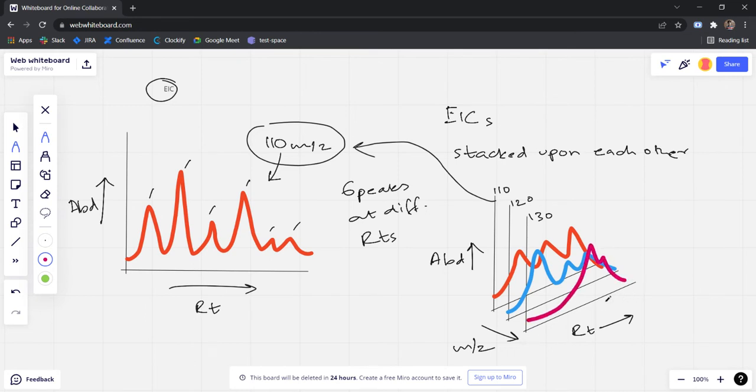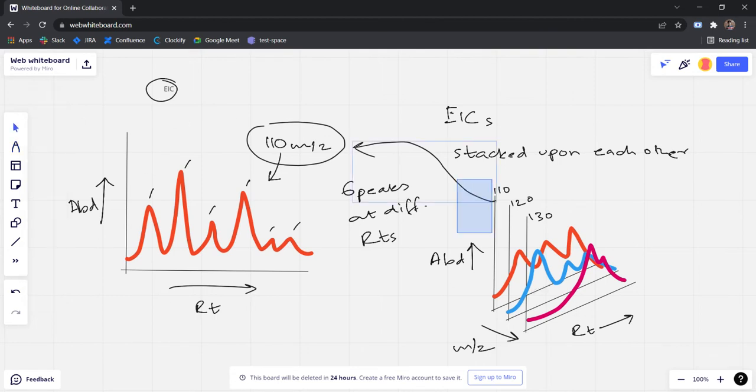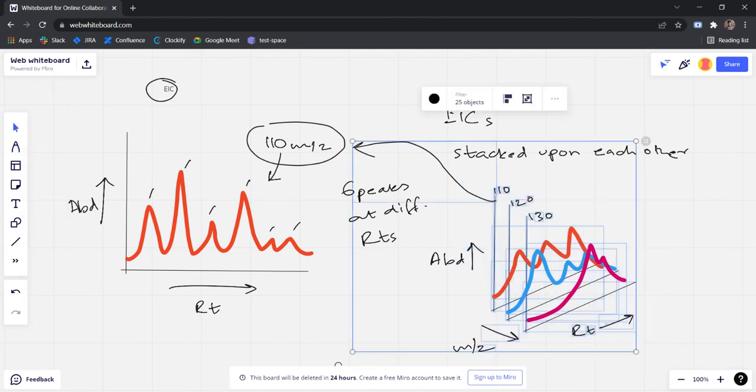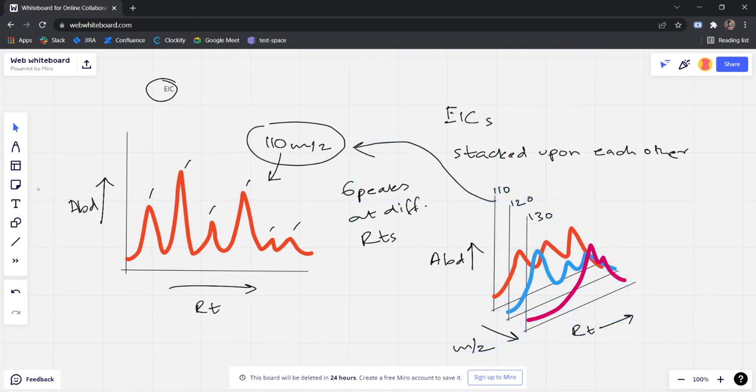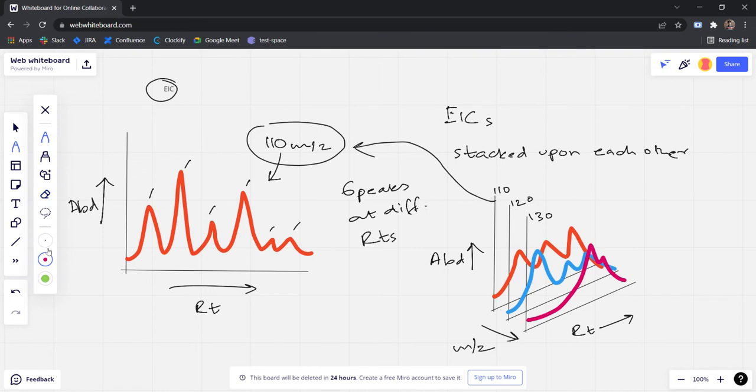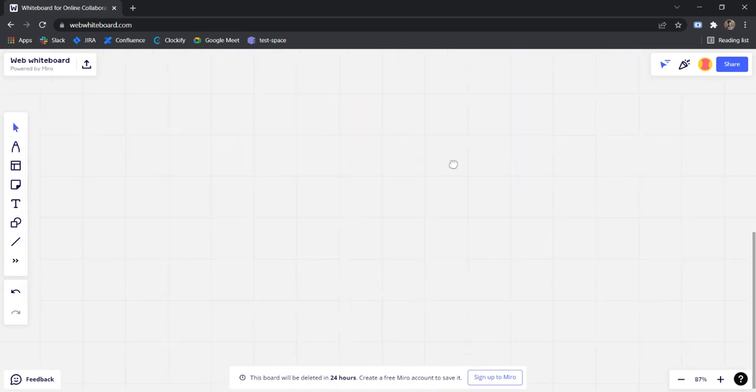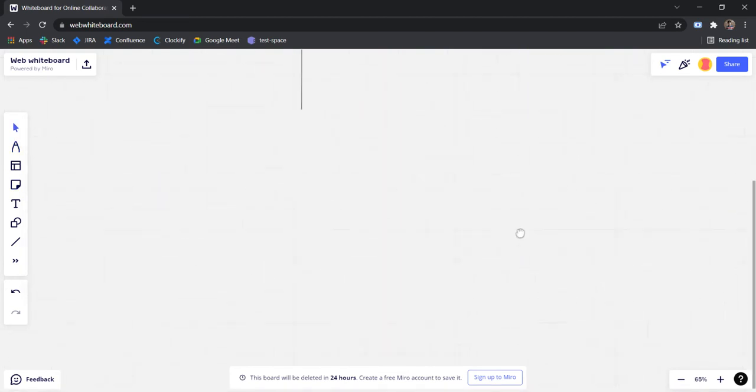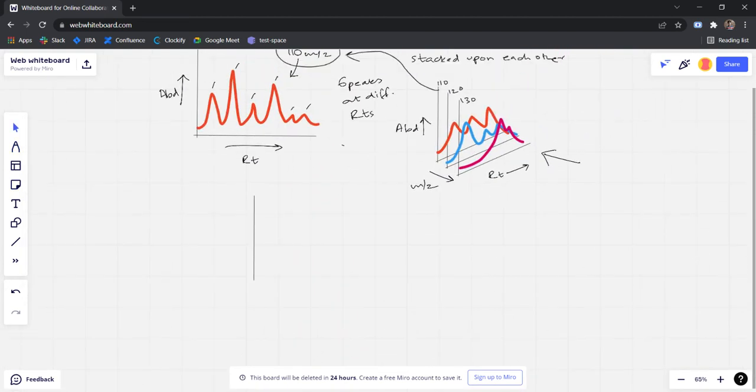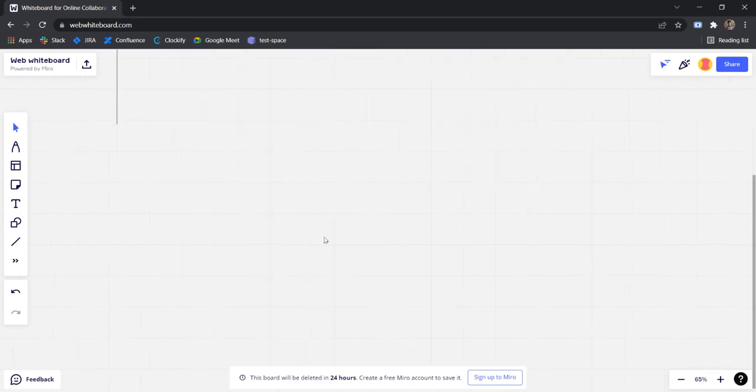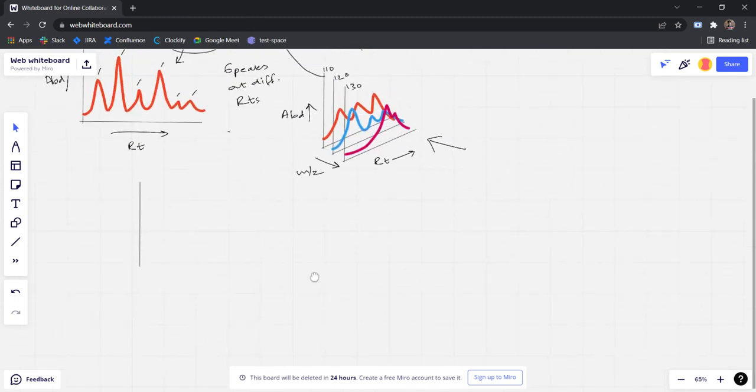Now if we visualize this thing from the front, that is I am viewing, I am trying to view this from this axis, then we are going to see a very different view which is the total ion chromatogram.